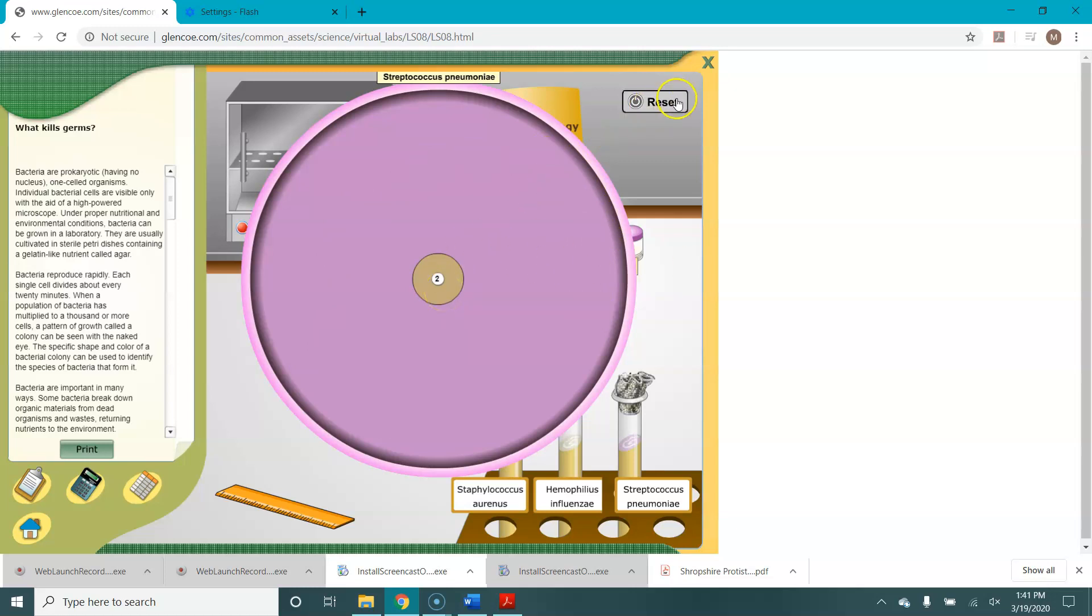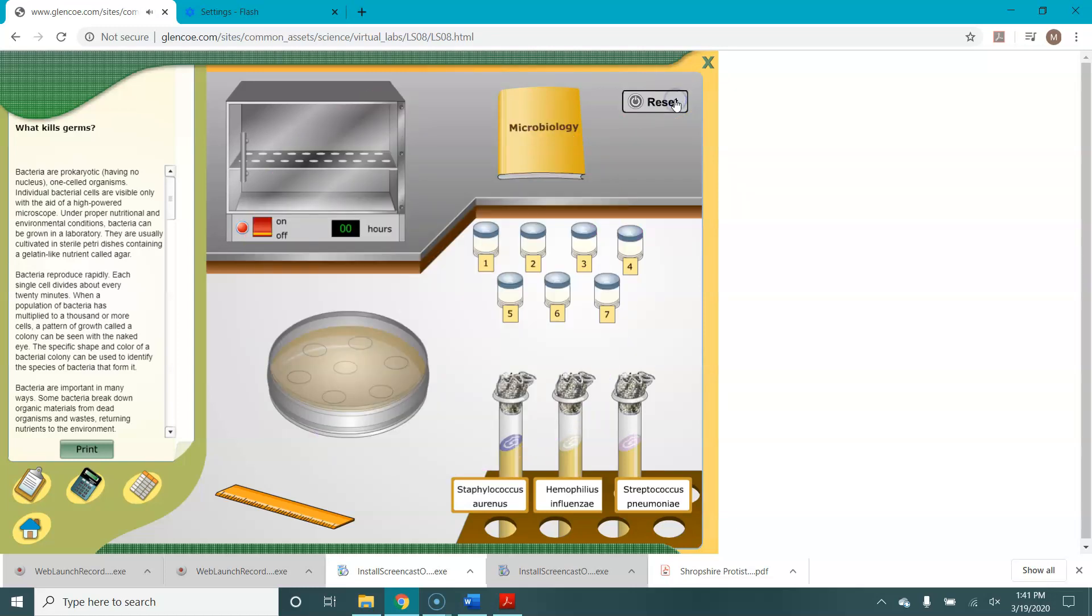So once you've done all three and recorded your data for all three, you would then go on to answer some of the analysis questions in the lab. So hopefully that helps you get started on this lab and good luck.